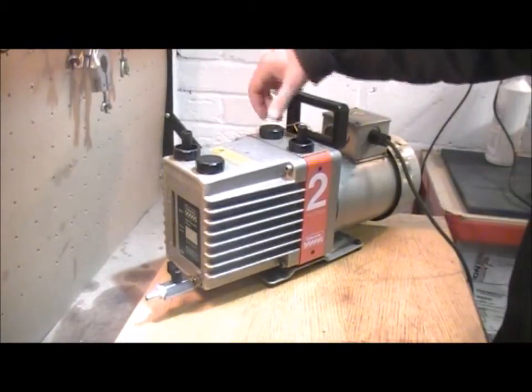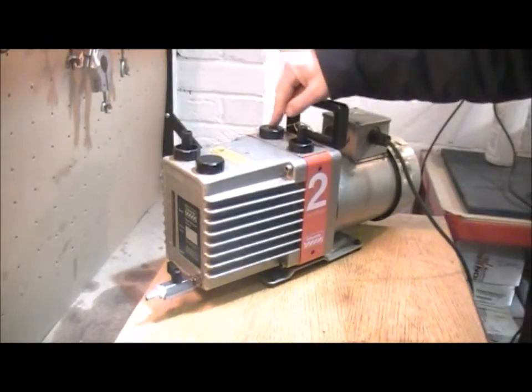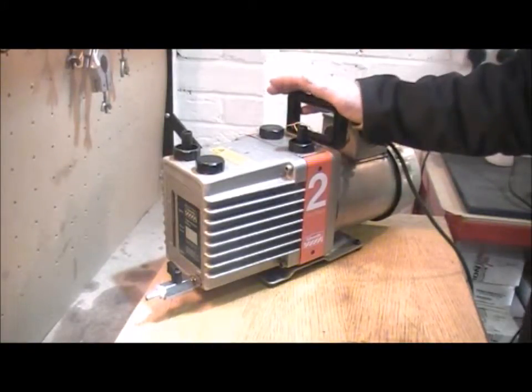Occasionally you'll see oil coming out of the gas ballast fitting up here. If you've got oil coming out of the gas ballast, it means that your non-return valve inside the pump has failed and you need to send the pump in for a full service.